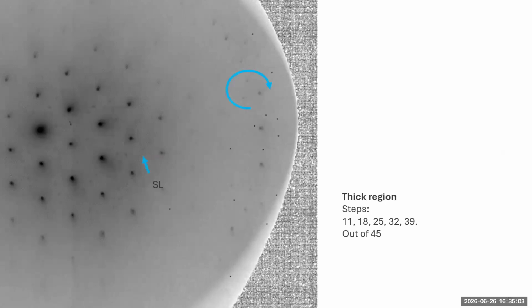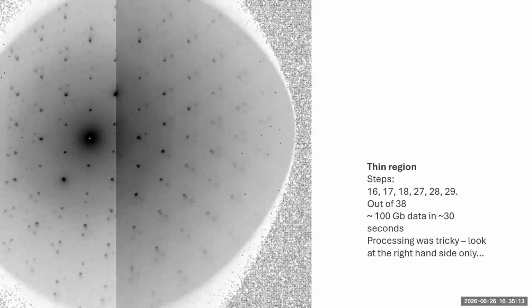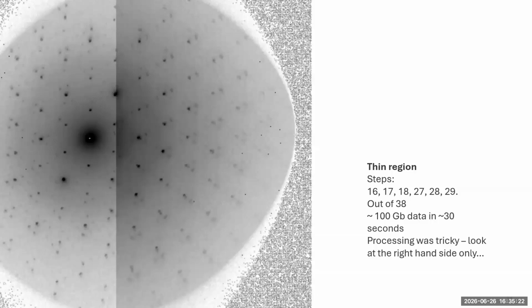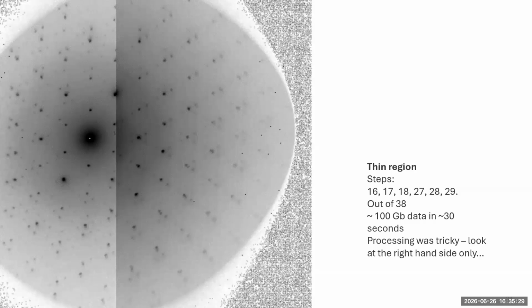If you look at the diffraction pattern from these things as we heated it, you can see the diffraction pattern change. If we go to a slightly different part of the sample, this was an early attempt at decoding, so it still looks a little weird. But again, as I heat it, you can see the main spots, the Bragg spots, are staying in the same place, and you see those little satellite spots. As you heat it, you can see them moving around. It undergoes some sort of phase change. So this is why we're trying to look at it with a fast detector, to see what's happening to these transient modes.